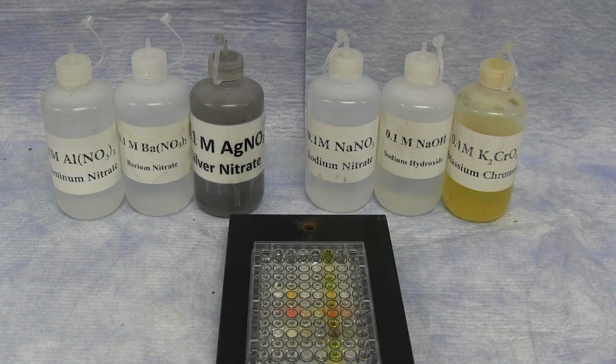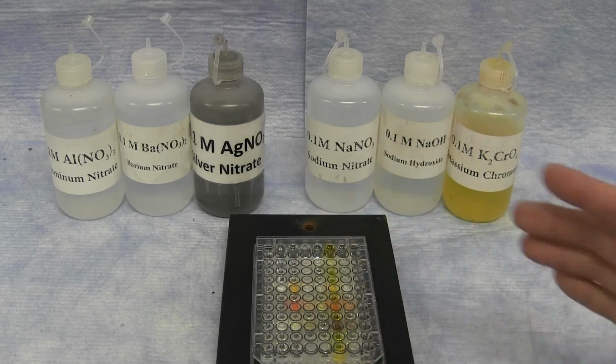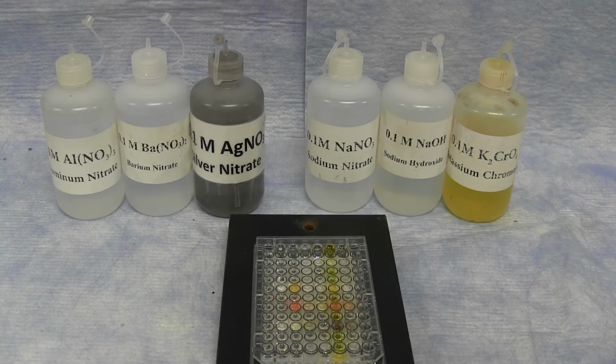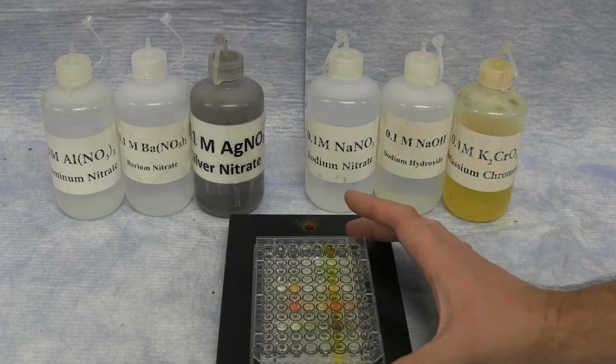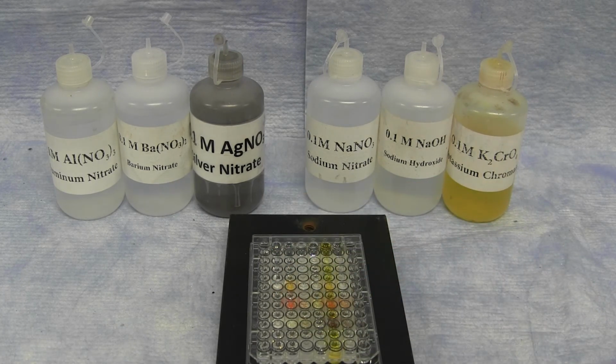This is the bulk of the experiment, and there will only be so many bottles in the room, so much of your time may be spent trying to find where those end up. But overall, you should be getting a full array of different compounds and different reactions. If you are unsure if a reaction has happened in this 96 well plate, you can always repeat the reaction in a larger test tube, so that way you can see the observations more clearly and make an informed observation about the combination.